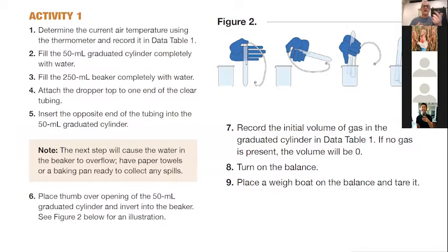And then what temperature are you going to use when you do your calculations? Are you going to use Celsius, Fahrenheit, or Kelvin? Kelvin. We always use Kelvin with gas. Always, always, always. Excellent. So we fill our graduated cylinder with water. We fill the beaker with water. Now what you should do is take, hang on, I'll be right back.